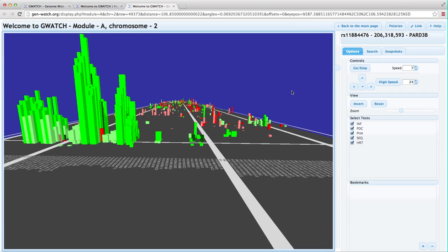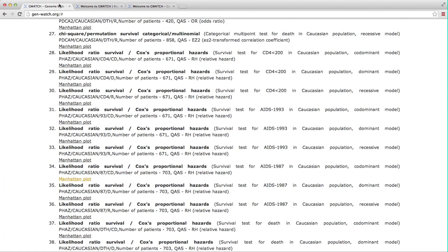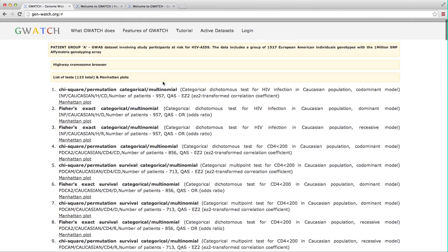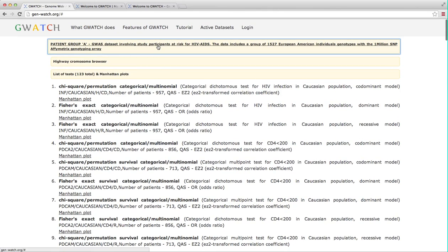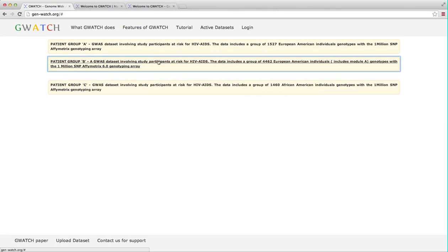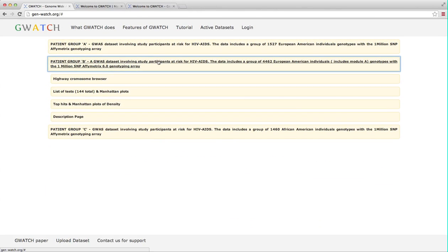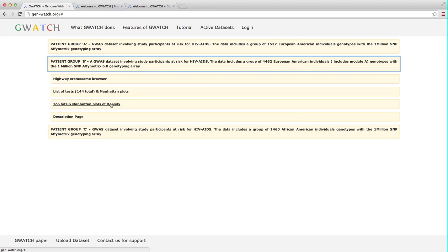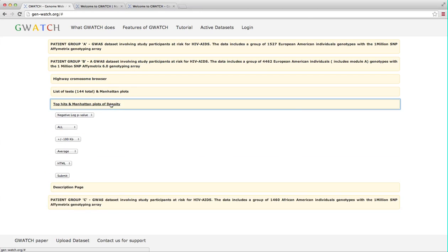Let's now go back to the active datasets page and look at the module B with 4462 Caucasian study participants. Now that you have seen all the results are already computed and awaiting your inspection in GWATCH, we can use the search options to find the greatest or biggest hits. These we can search for in the top hits section in one of the datasets.